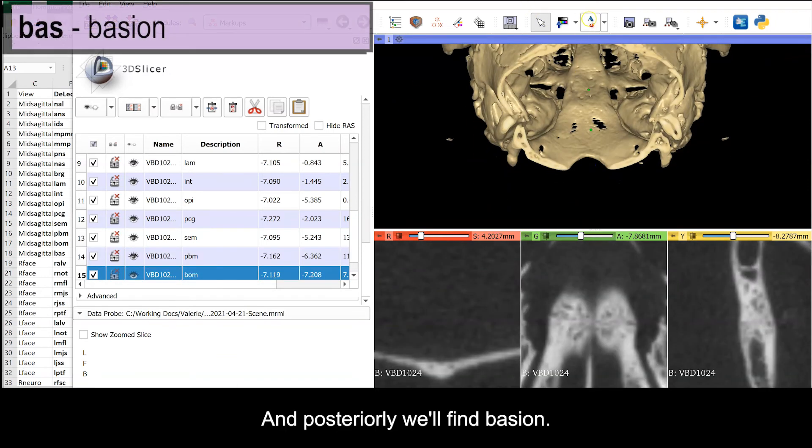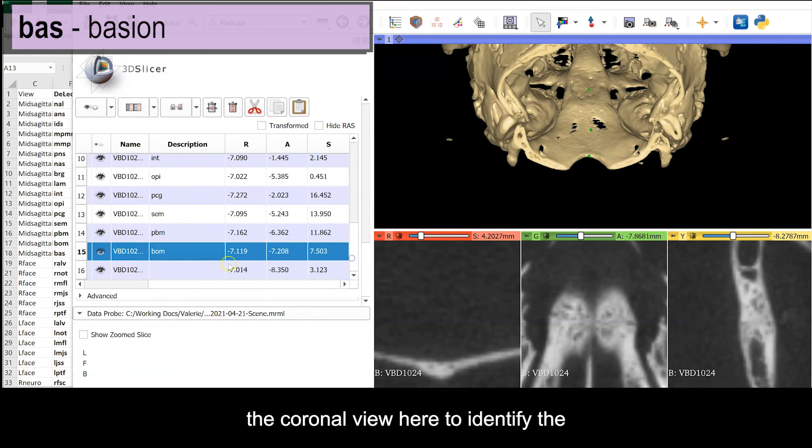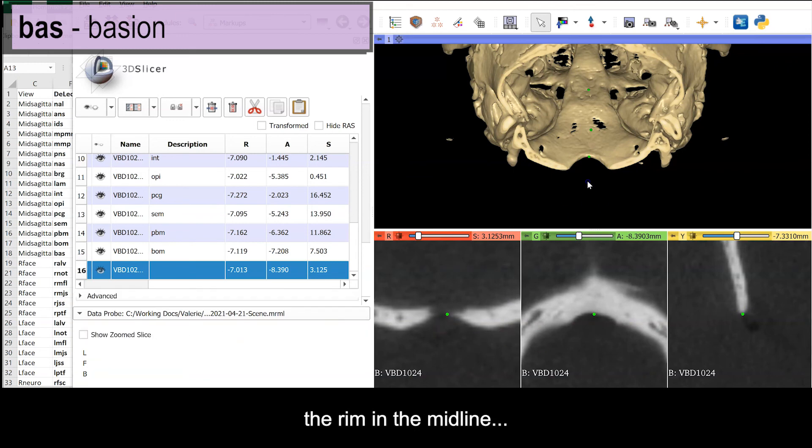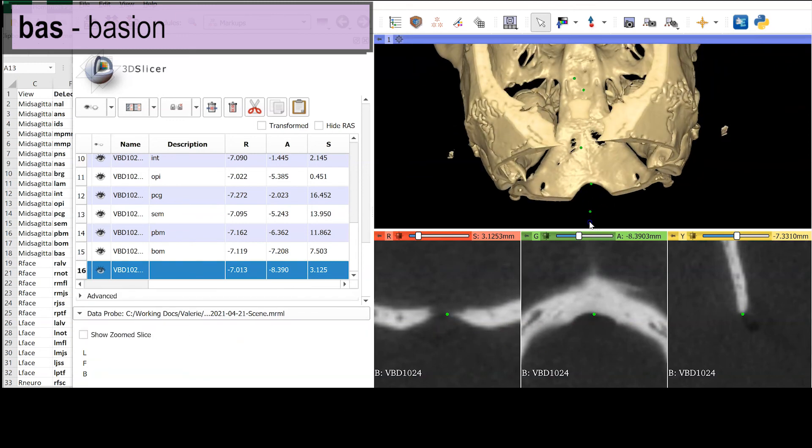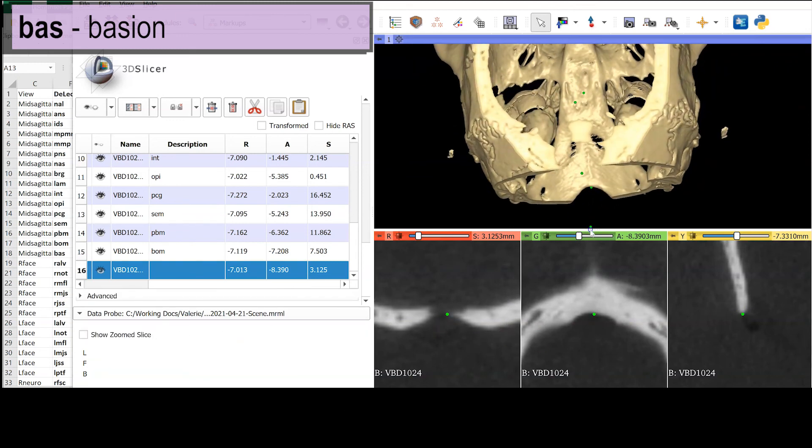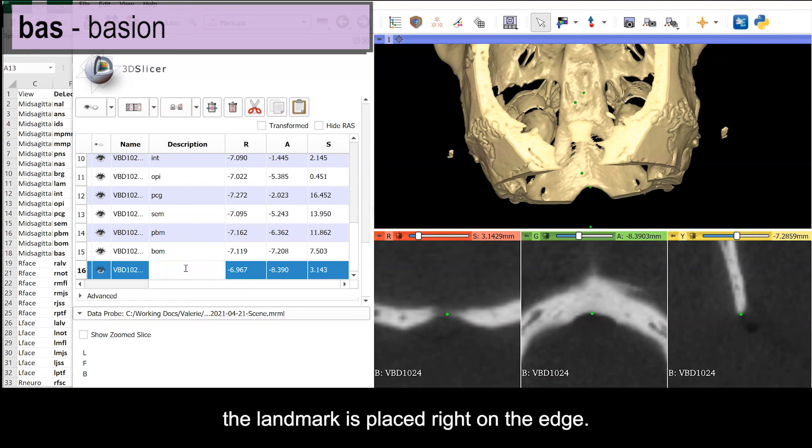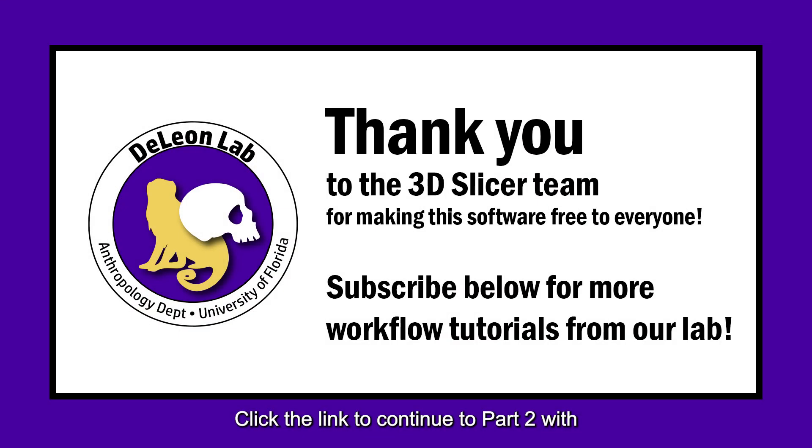And posteriorly, we'll find basion. Again, use the radiolucent gap in the coronal view here to identify the most anterior point of foramen magnum and place the landmark on the rim in the midline using the sagittal view to confirm that the landmark is placed right on the edge.